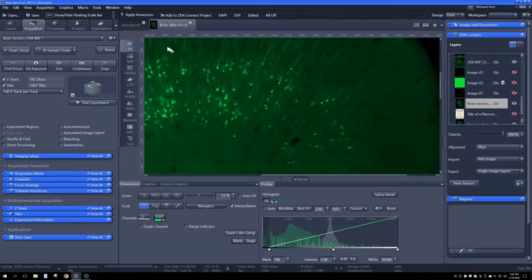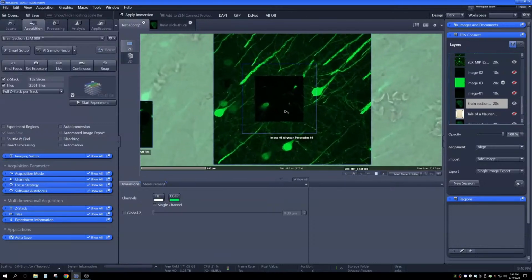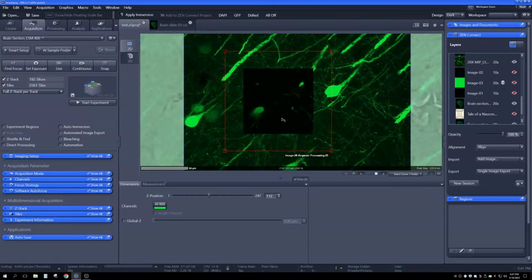By doing that, I was able to get to my two neurons of interest that I call the neuron pair. And here is the 3D Z-stack image. It's a 40 micron Z-stack acquired with the Airyscan detector. I'm actually playing through the Z slices within the Connect project.